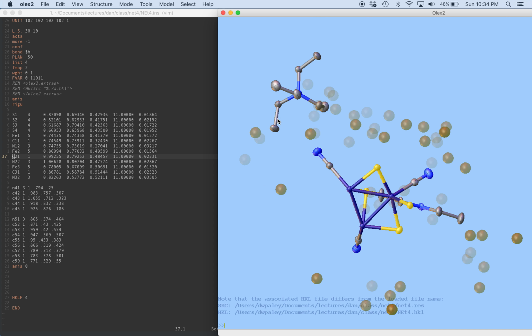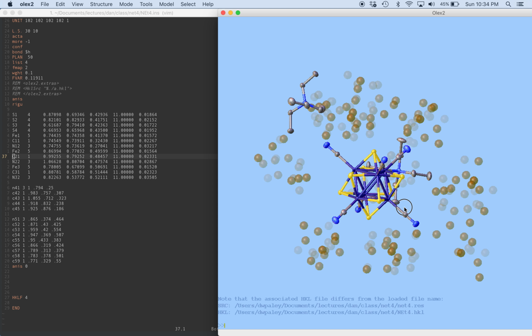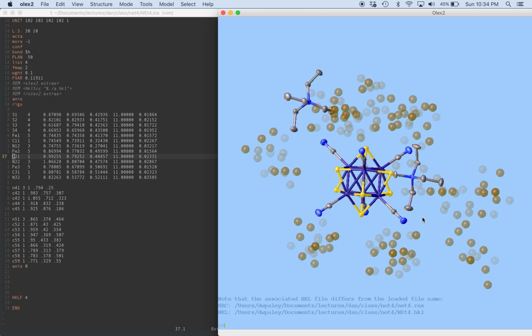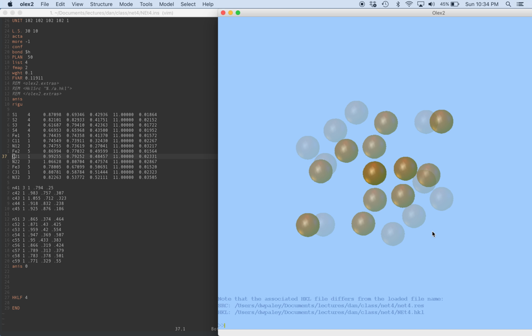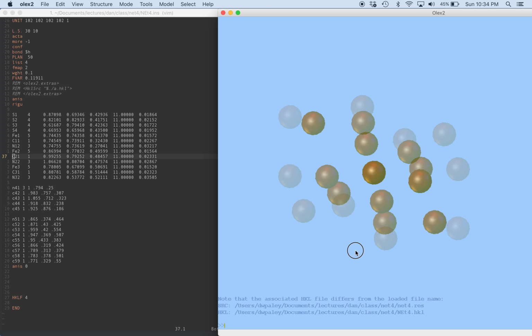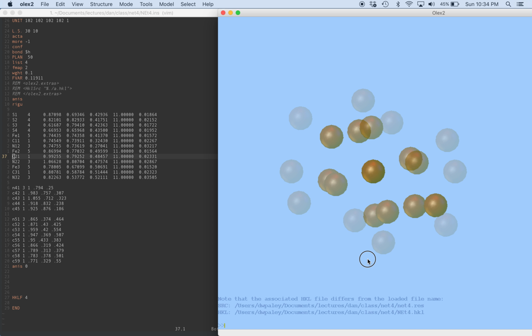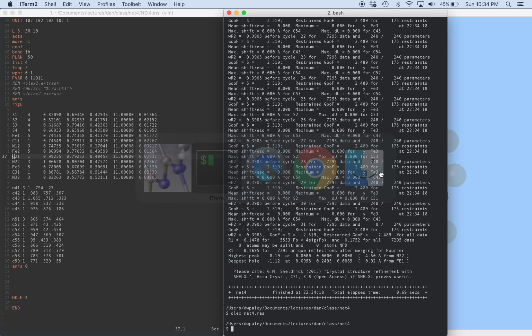And we're just going to pick the most prominent remaining disordered tetraethylammonium and build a model for that one. So I'm going to select Q1. We'll see where that is. It's over here. I'm going to double click on this whole thing, show this fragment only, and remembering the philosophy of going back lots to add atoms and make new difference maps, I'm going to start by just adding the nitrogen atom in the center.